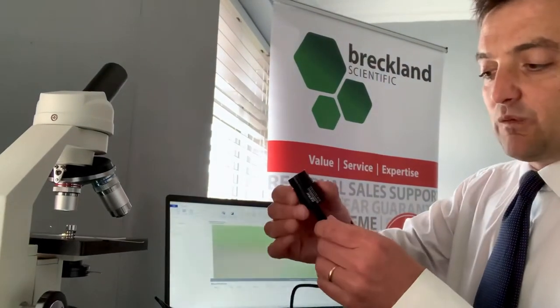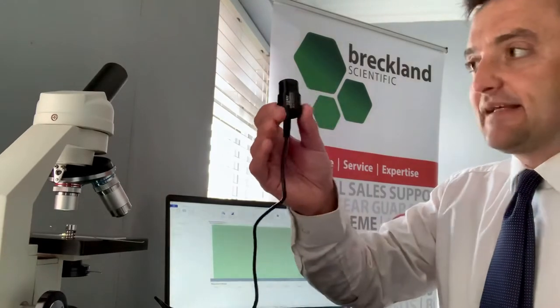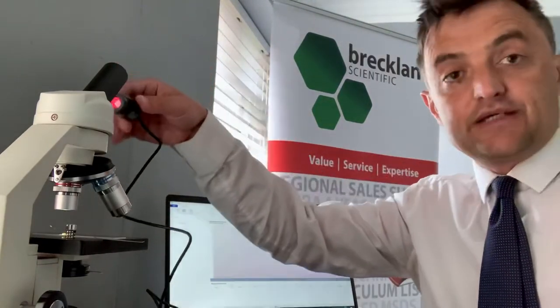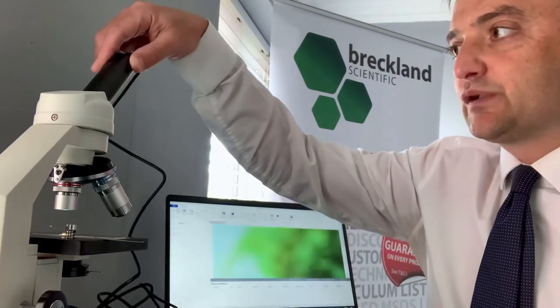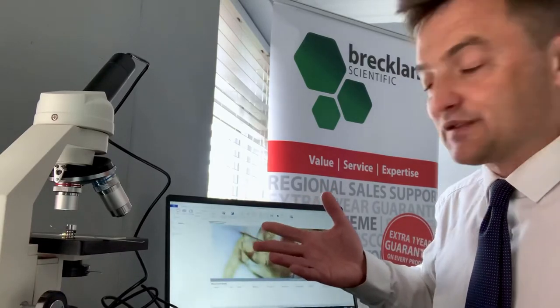So what about the camera? Well, quite simply, there it is again. Let's just plug that into our microscope - we're just using a Motic SFC 100 LED here. Let's just push that in. It's going to fit pretty much any microscope you've got in your school. There's our image straight away.